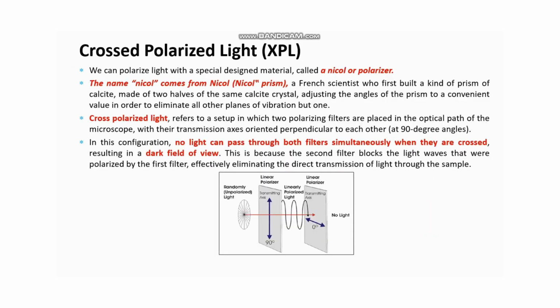But now, this is different from cross-polarized light. With cross-polarized light, you are placing two polarizers, but when you place them, you make sure that they are crossed, that they are perpendicular to each other.